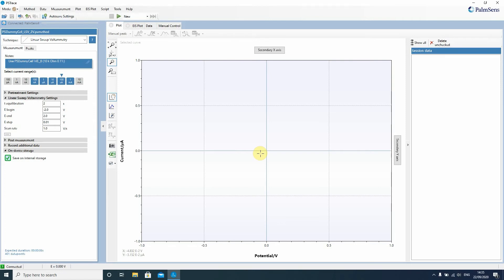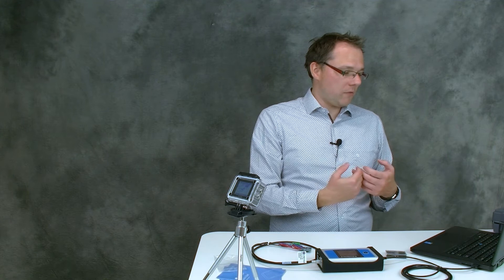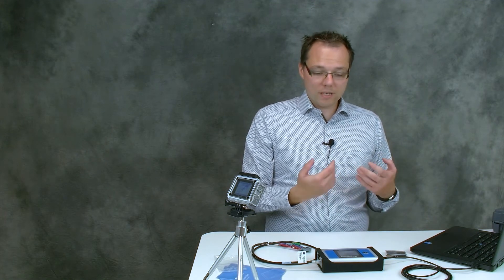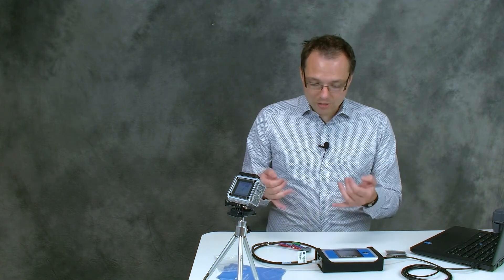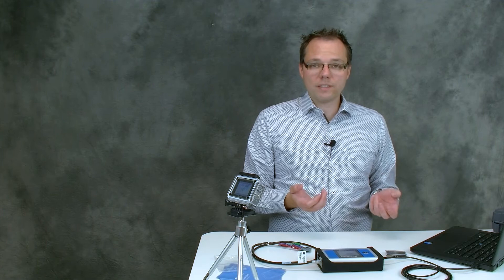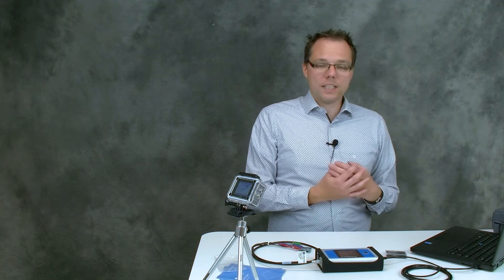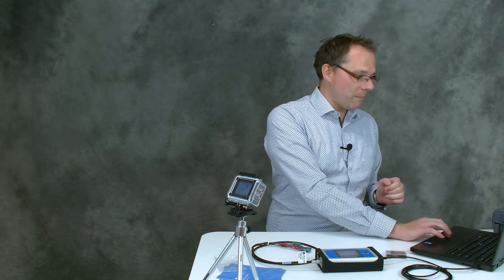OK so now we want to do our first measurement. It's a very simple linear sweep voltammetry. That means we're just changing the potential in linear way and our dummy cell circuit is just a resistor so we're expecting a diagonal line in the voltammogram.